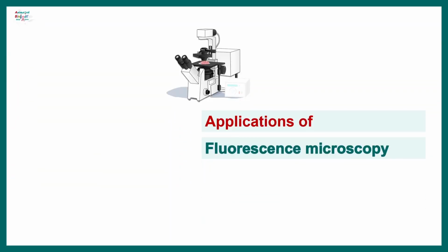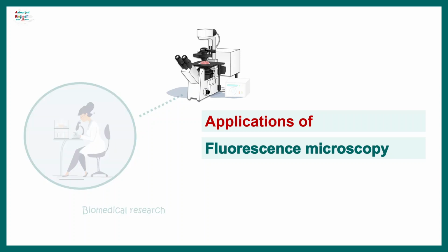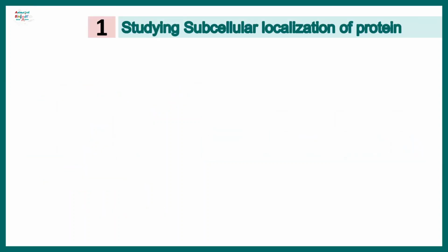Now let's talk about the applications of fluorescence microscopy. Fluorescence microscopy can be used in biomedical research, and it has clinical applications as well. So let's talk about the biomedical research part.